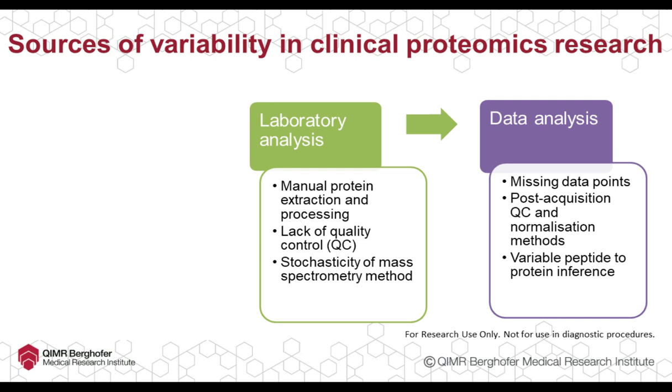So in terms of data analysis, sometimes across the subjects, certain protein measurements could be missing. So that means it was not measured. And so in this case, it may not be very clear whether or not the protein measurement is 0, or it just did not get selected in the MS1 level. So this is common in the DDA approach. When an MRM method is used, where a list of proteins and peptides are targeted, there are usually low missing values. And similarly, if a DIA method is used, then there are again low missing values.